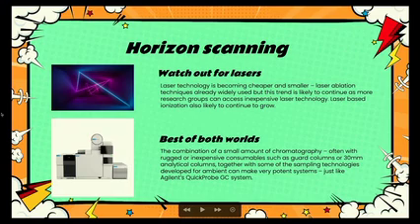So there's a quick probe GC system, which has an incredibly short GC column and can do very, very rapid analysis, but still gives a little bit of separation. And maybe a little bit of work on using things like LC guard columns just to do a tiny little bit of separation, or some sort of 3 centimeter columns as well, to get high throughput, but also maybe remove some of the issues of having matrix in your samples.